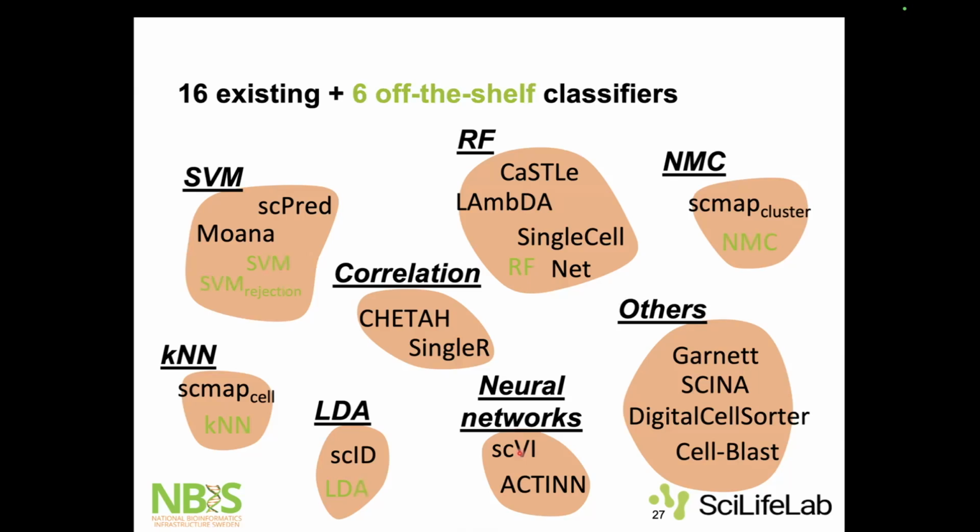Then they also added 6 off-the-shelf classifiers. This means classifiers that were not trained or tuned for a certain cell atlas or reference data set.